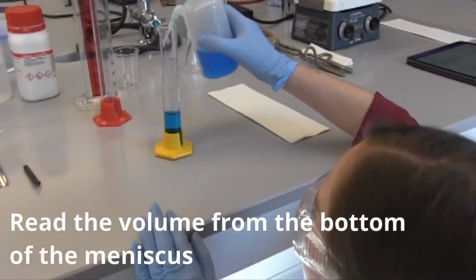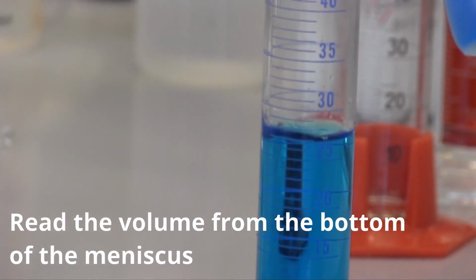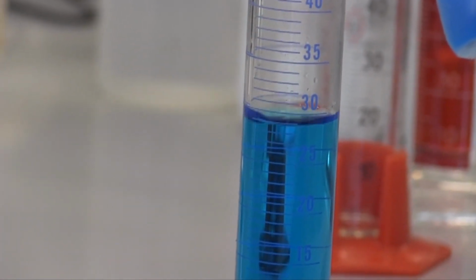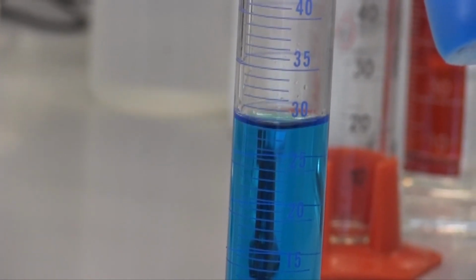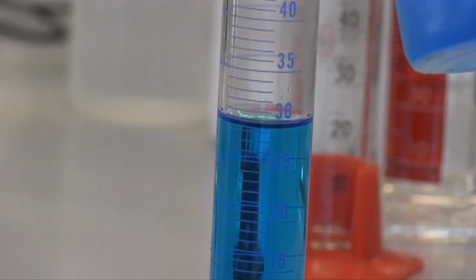Be sure that when you read the volume of the copper solution, you're at eye level and you read from the bottom of the meniscus. Record the exact volume of the copper solution in your lab notebook.